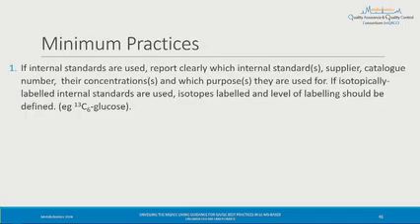And then if you go to our minimum practices, there we are very simple. We are just saying if you are using it, tell us what you are using, what concentration, and for which purpose that you are using it.